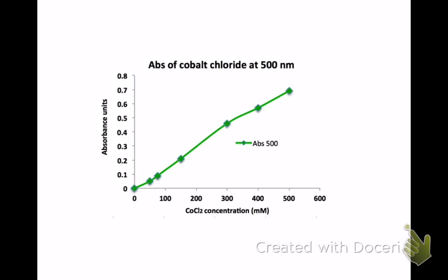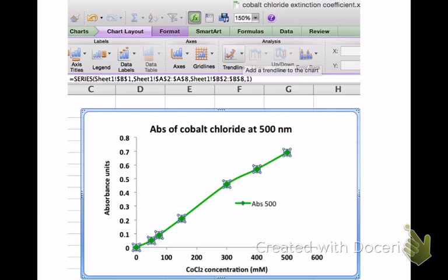Now we want to get a straight line from this. So we're going to select that line, put your cursor on that line, and you'll get some options to manipulate the line. Now I'm showing you the menu that you get in Excel after selecting your line, and what I'm going to focus on now is this category over here called Trendline.